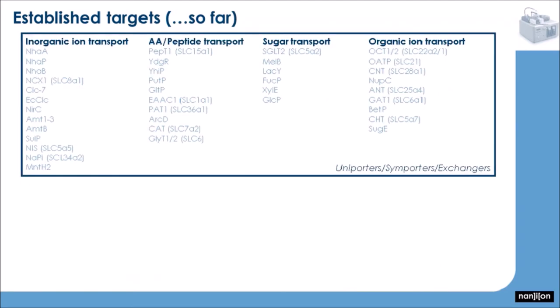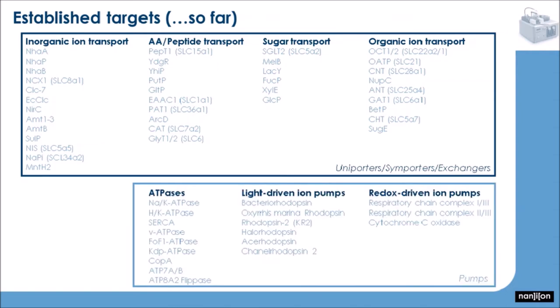So far, a lot of targets have been measured with this technology. Most of them are actually uniporters, symporters, or exchangers. Most of them symporters, actually. So here you can see a list sorted by the substrate which is transported. But there's also a bunch of pumps which have been measured and some channels. Most of this is actually published.